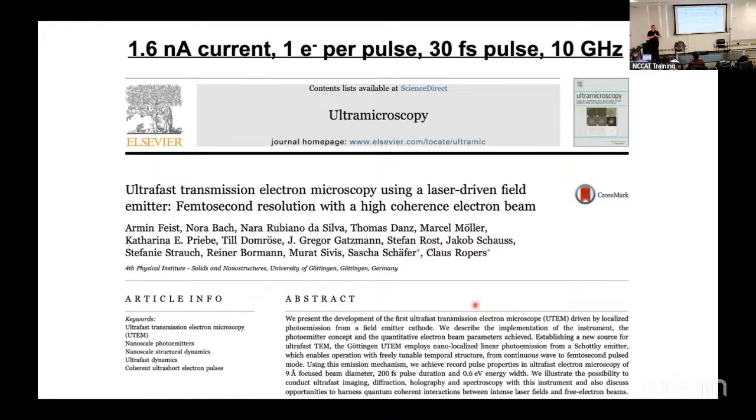So the problem with continuous, I would like to have kept continuous as well, because all the engineering and all the work that has gone into creating the very beautiful beam that you have on a Krios, or formerly a Zeiss or a Jeol, it all comes out of this development of wonderful sources of electrons, beautiful FEG sources. The problem if you use a pulsed electron, yes, the pulsed photons do have that instantaneous pulse peak power that you need to deflect the electron beam.